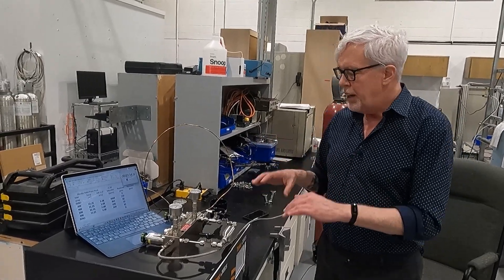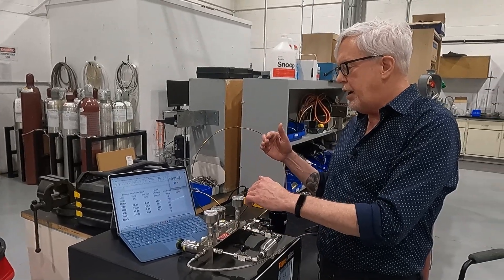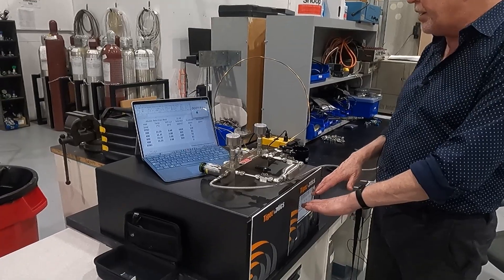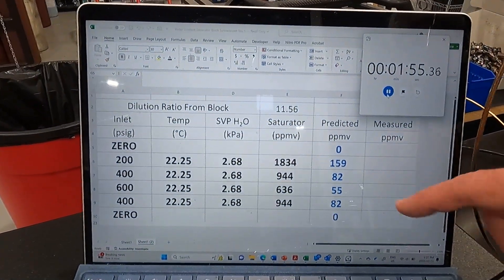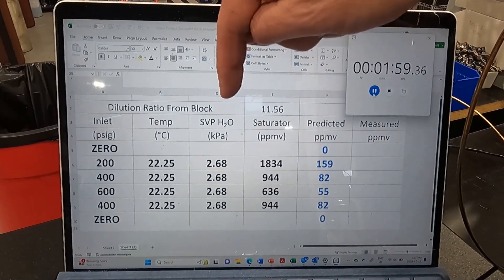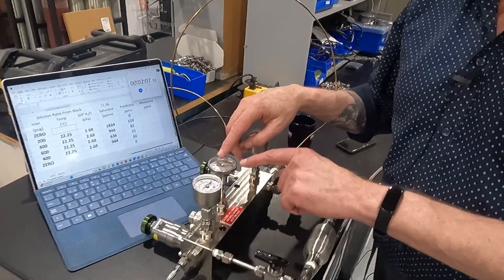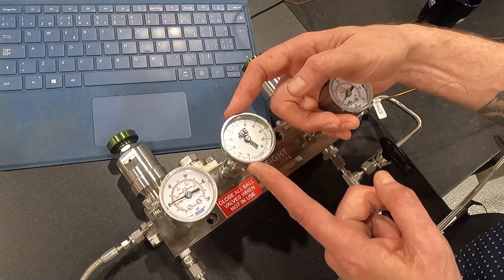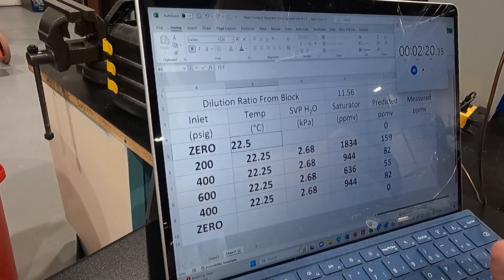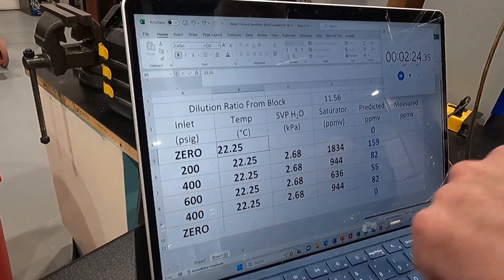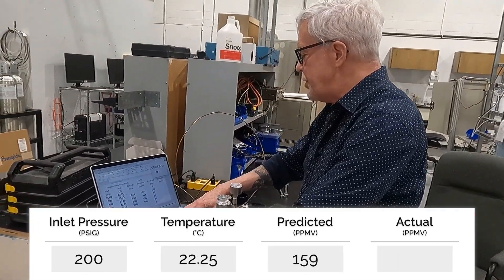What I'm going to do is allow it to run through the moisture saturator, change the pressure in the saturator, and determine what moisture content we measure at that analyzer, then compare it in this spreadsheet to the predicted concentrations based on the assumption that the block will saturate it with water vapor at a known temperature. Looking at the block right now, the mechanical temperature gauge is reading about 22.25 degrees C. Running zero gas, we're reading 0.08 parts per million, or 80 ppb.